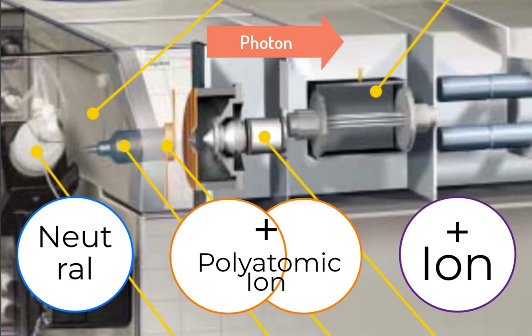So the first thing that this ion stream or sample stream encounters after the plasma is the sampling cone. So this is a nickel cone, and you'll be able to see this towards the end of the video up close. But this is a cone that the plasma hits directly, and it's water cooled, so it doesn't melt or anything. But it has a tiny orifice that's 1 millimeter wide. So this is just a little hole, and you line it up so that the hottest part of the plasma is hitting that hole, so it'll go through it.